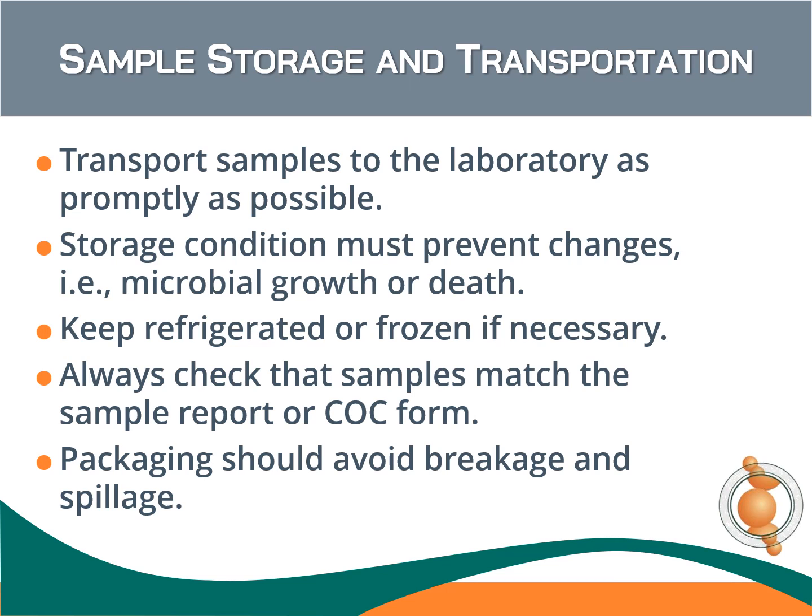Storage conditions should be stable and must prevent changes to the samples, especially microbial growth or death. Keep samples refrigerated or frozen as necessary. Before sending samples out, check that your physical samples match the chain of custody form. Be sure that the samples are packaged to prevent breakage or spillage of the samples.